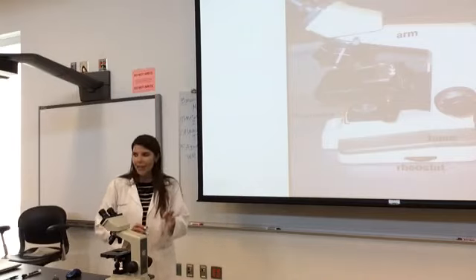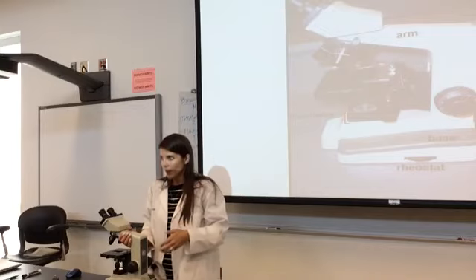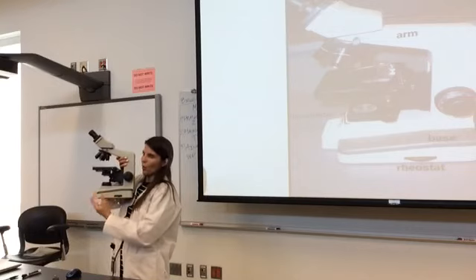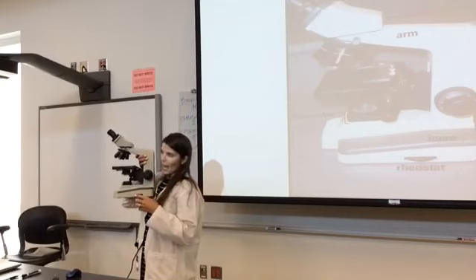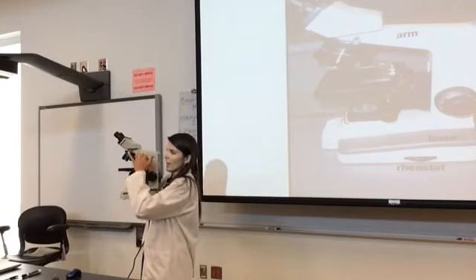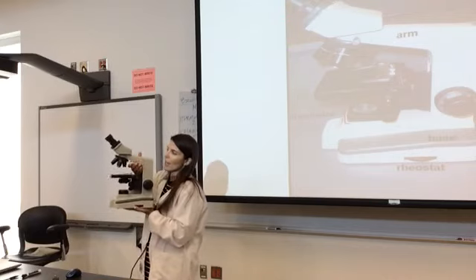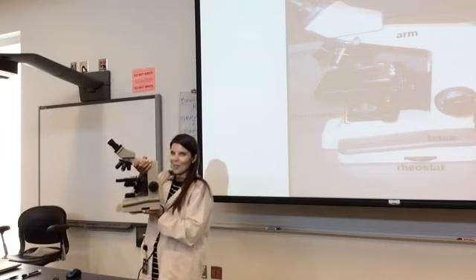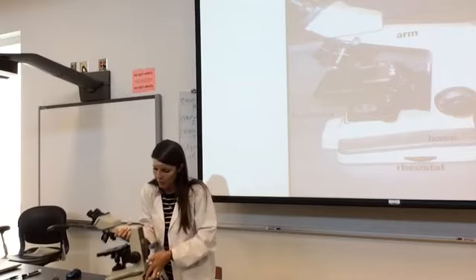Going over basic anatomy, I'm just going through the demonstration PowerPoint that was provided to you on eCampus. You have the base of the microscope, that's this bottom part. The rheostat is here to control the light. This part right here is considered the arm of the microscope. If you transport your microscope, we ask that you grab it by the arm and put another hand under the base.